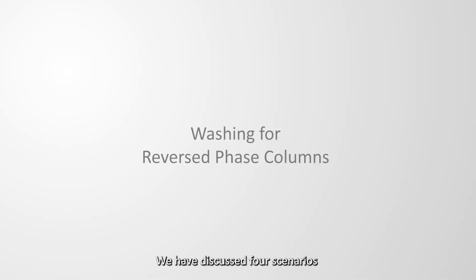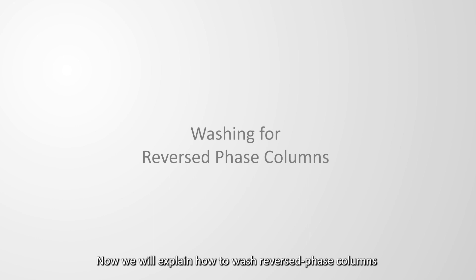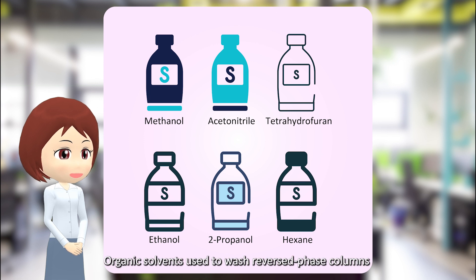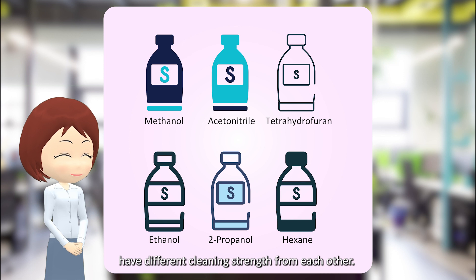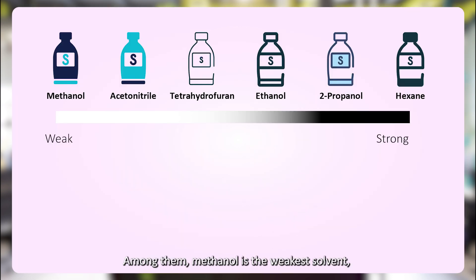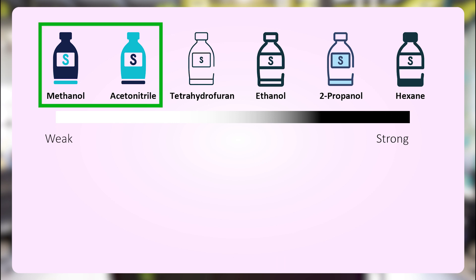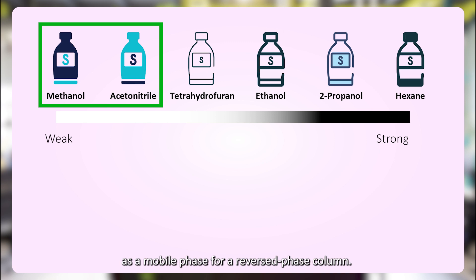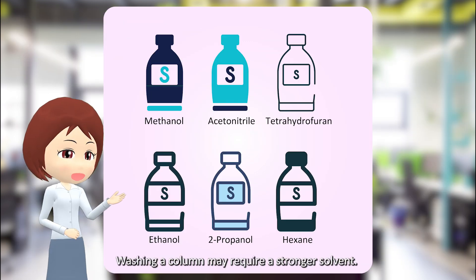We have discussed four scenarios where you should wash your columns. Now we will explain how to wash reversed phase columns such as C18 columns. Organic solvents used to wash reversed phase columns have different cleaning strength from each other. A weak solvent is usually used as a mobile phase for a reversed phase column, but washing a column may require a stronger solvent.